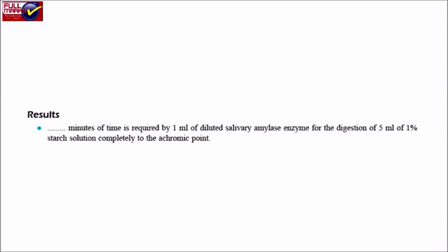Results: Minutes of time is required by 1 ml of diluted salivary amylase enzyme for the digestion of 5 ml of 1% starch solution completely to the achromic point.